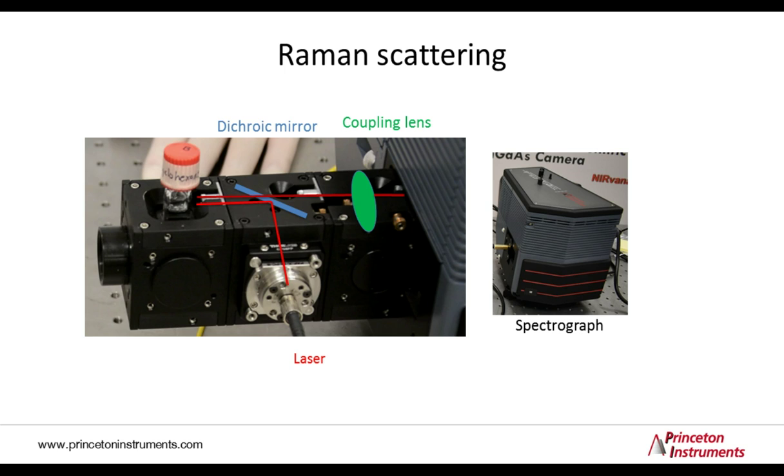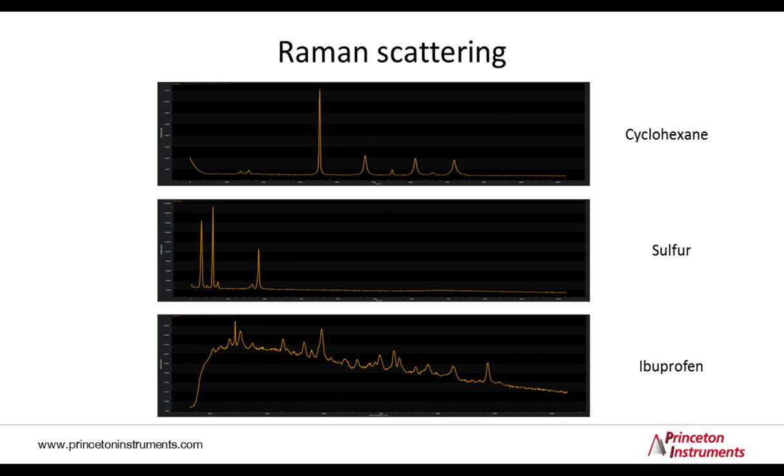That's why it has a pretty large background, but nevertheless you see discrete lines, and one can easily see that those lines are different for any material.